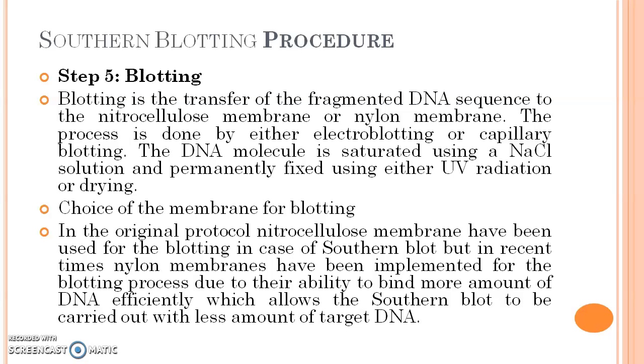Blotting is the transfer of the fragmented DNA sequences to a nitrocellulose membrane or nylon membrane. The process is done by either electroblotting or capillary blotting. The DNA molecule is saturated using a sodium chloride solution and permanently fixed using either UV radiation or drying.